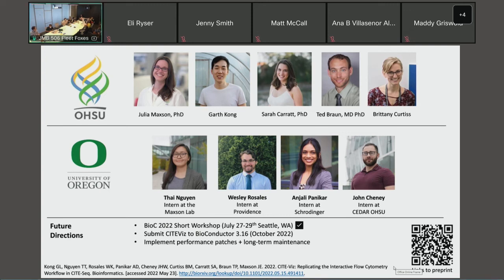Okay, great. And is it agnostic to the feature type you have? So can I actually be gating on the mRNA instead of the antibody signature? Yes. Yeah. Even though the RNA matrix is really sparse now, we built CITE-Viz to accommodate future changes in sequencing technology, and we hope that it's less sparse. So we did keep that feature in there, but you just have to be very careful because the data is very sparse on the RNA portion.